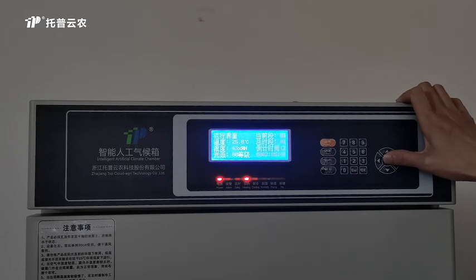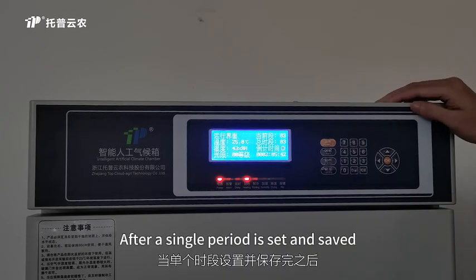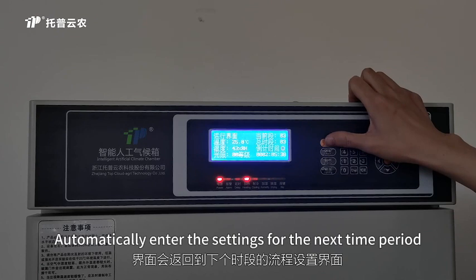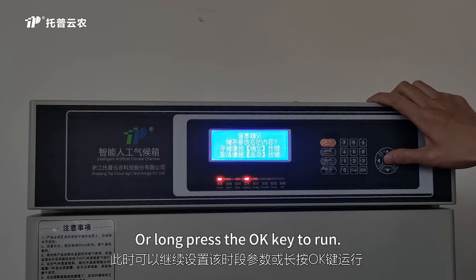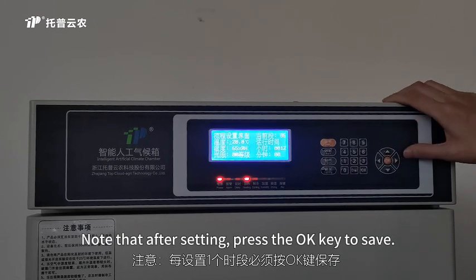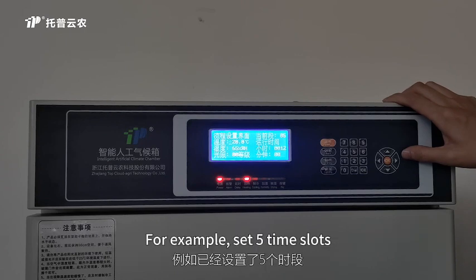3. Additional time period. After a single period is set and saved, the interface automatically enters the settings for the next time period. You can continue to set up at this point, or long press the OK key to run. Note that after setting, press the OK key to save. Setup complete. Long press the OK button to run in the last period.